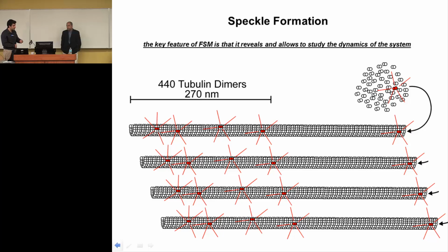I think here for me the hardest problem is to dissect the antiparallel motion, because oftentimes we can see it by eye, but it's impossible to reliably track, because they are so close to each other and they move fast, and we cannot sample very, very often.